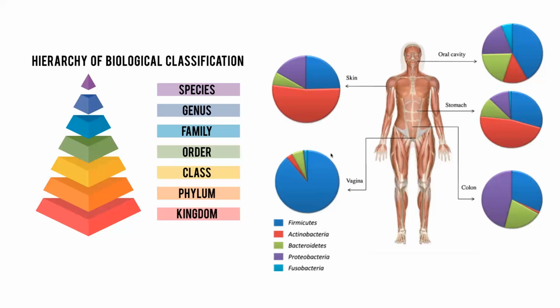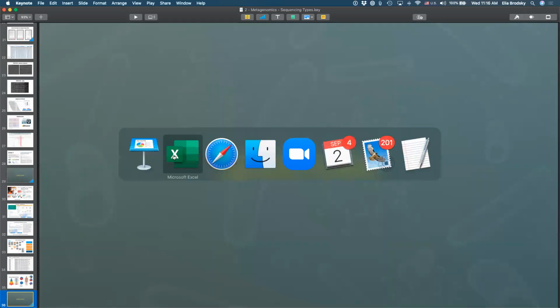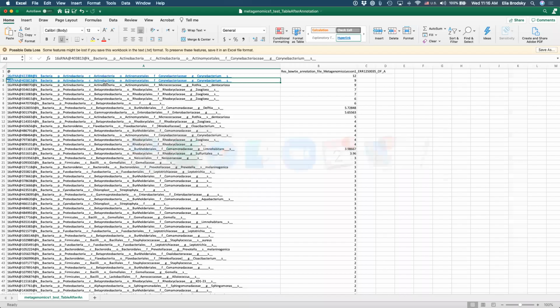So when we look at this table, right, we see the actinobacteria. So we really need to know what the sample is of to understand whether what we are seeing is normal or expected, or is this some kind of a dysbiosis? And in our next session, by the way, we will talk about some of the impacts of this kind of compositional studies on the functionality of these bacteria, on how we evaluate whether it's normal, healthy, or there's a dysbiosis that we can infer from what we understand.